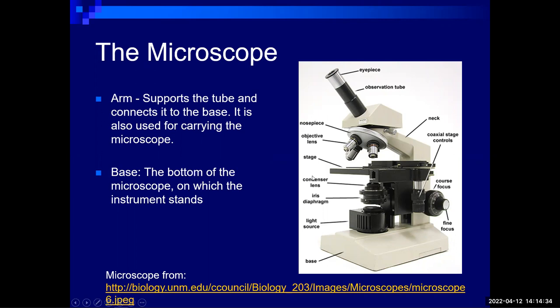It's usually very heavy. Why do you think the bottom of the microscope is very heavy for one particular reason, so that what would not happen? It won't break over. Yeah, right. You know, it wouldn't topple over. So right, so it's very heavy for that reason.